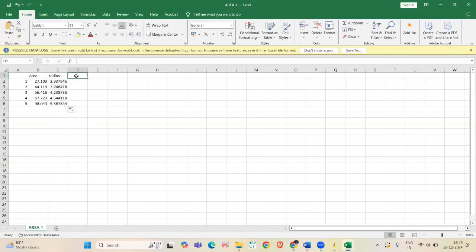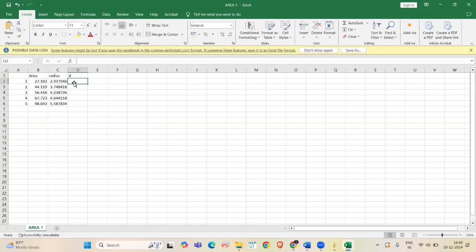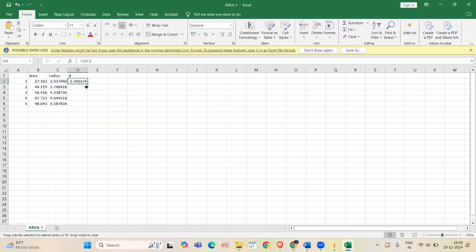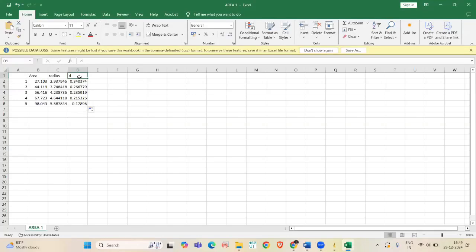And now, from this r, we have to find d values. For that, using the formula equal to 1 divided by r. Now, the radius cell number is C2. And here, I am just dragging. Here, the d value is in nanometer.